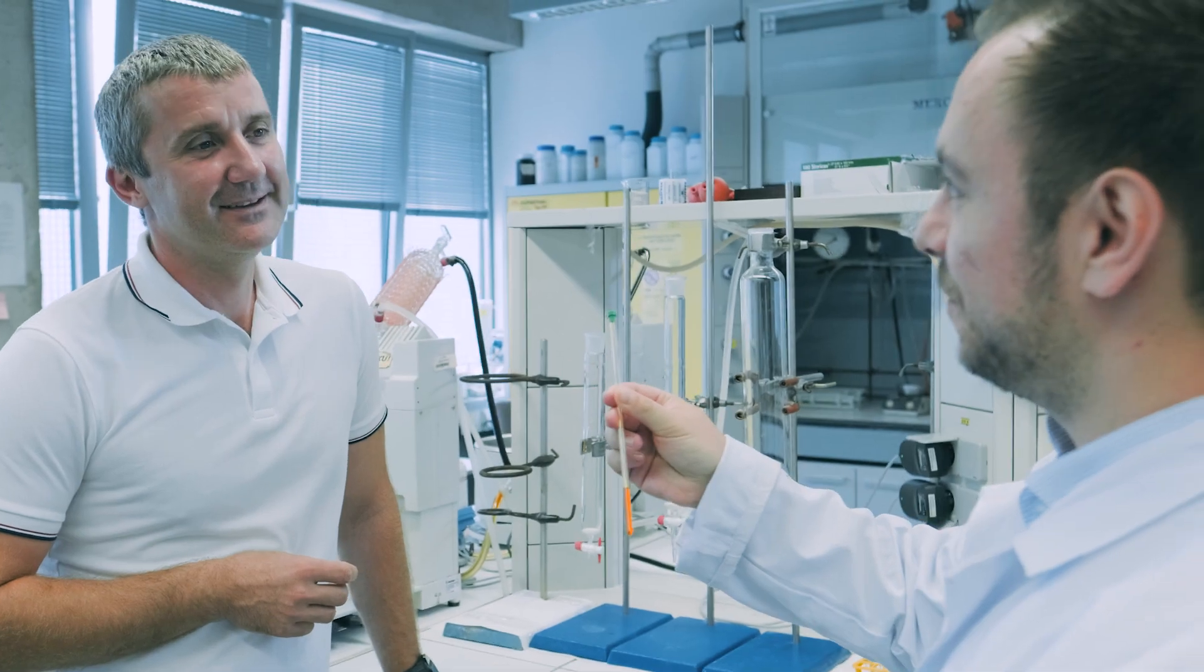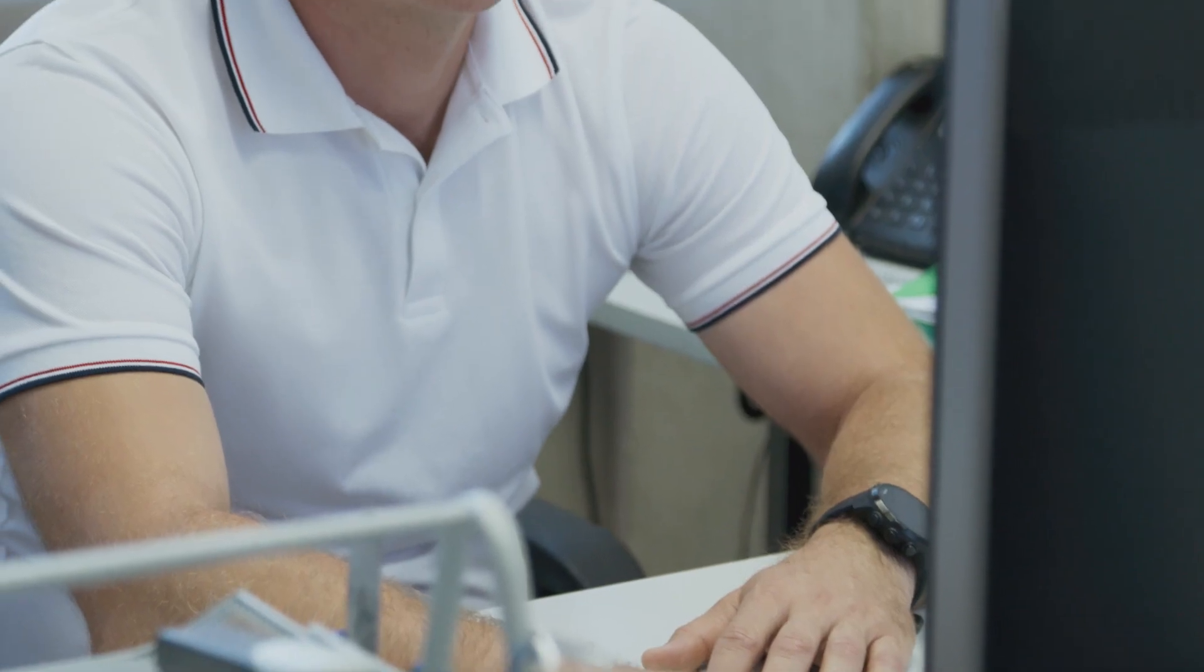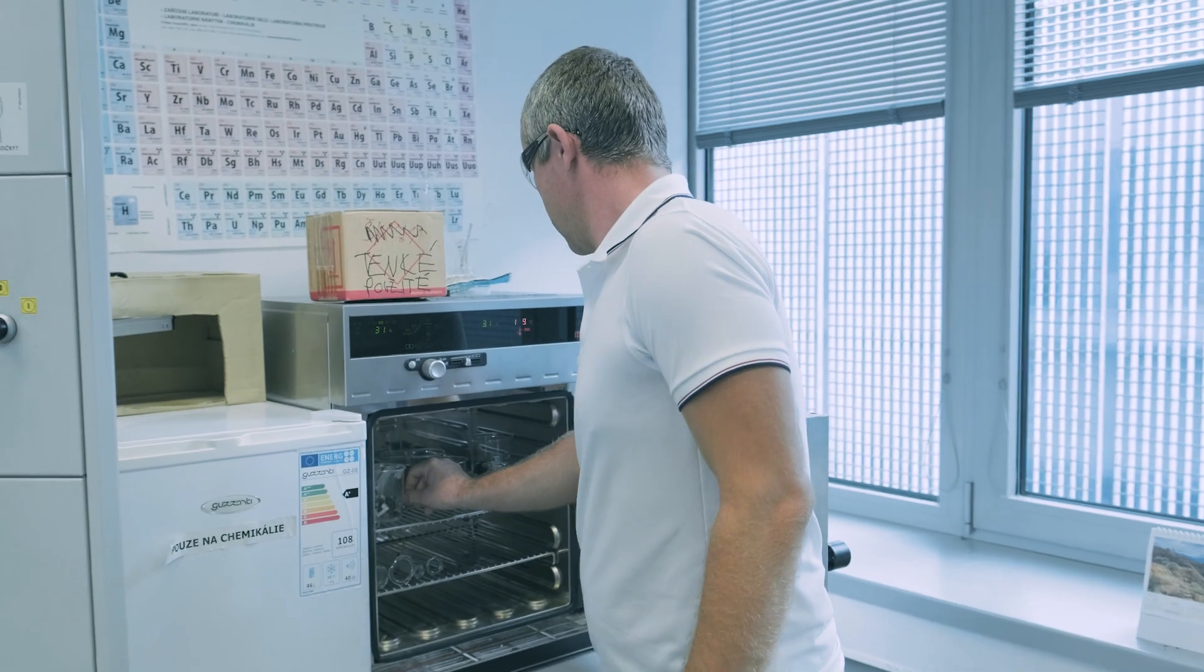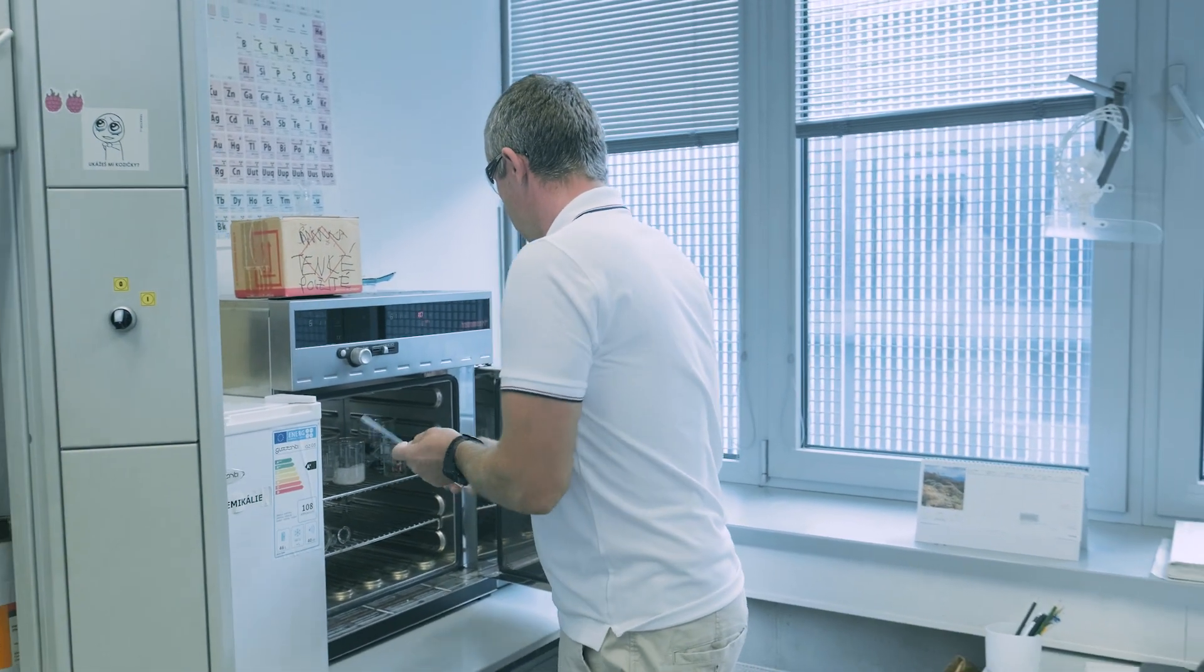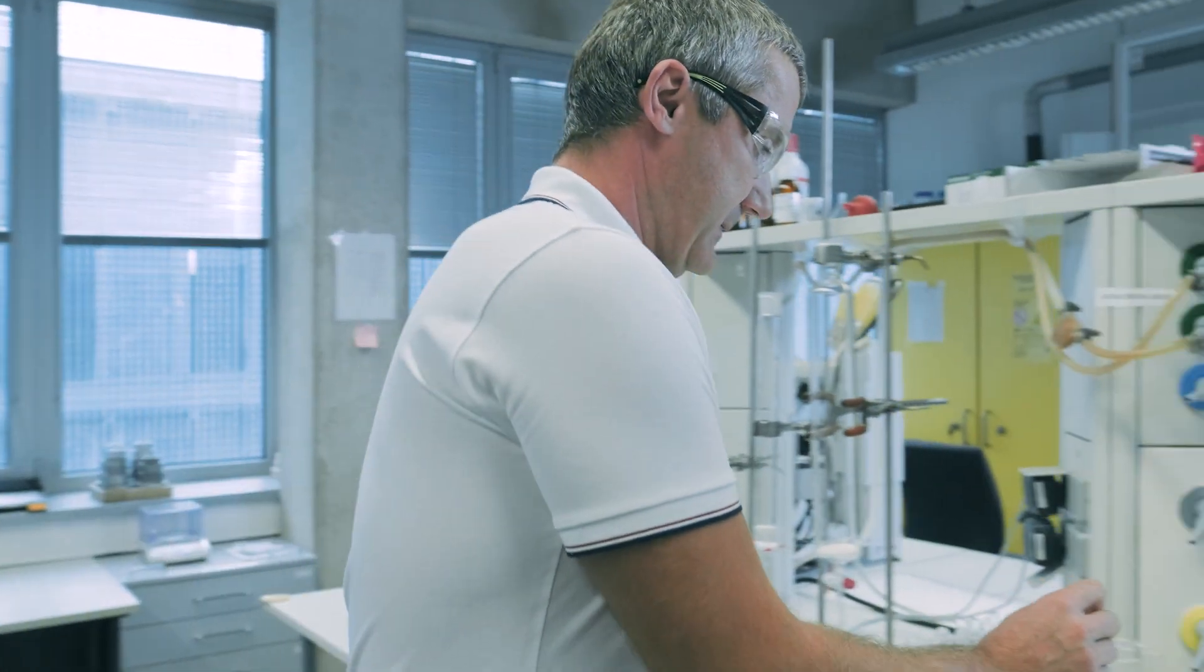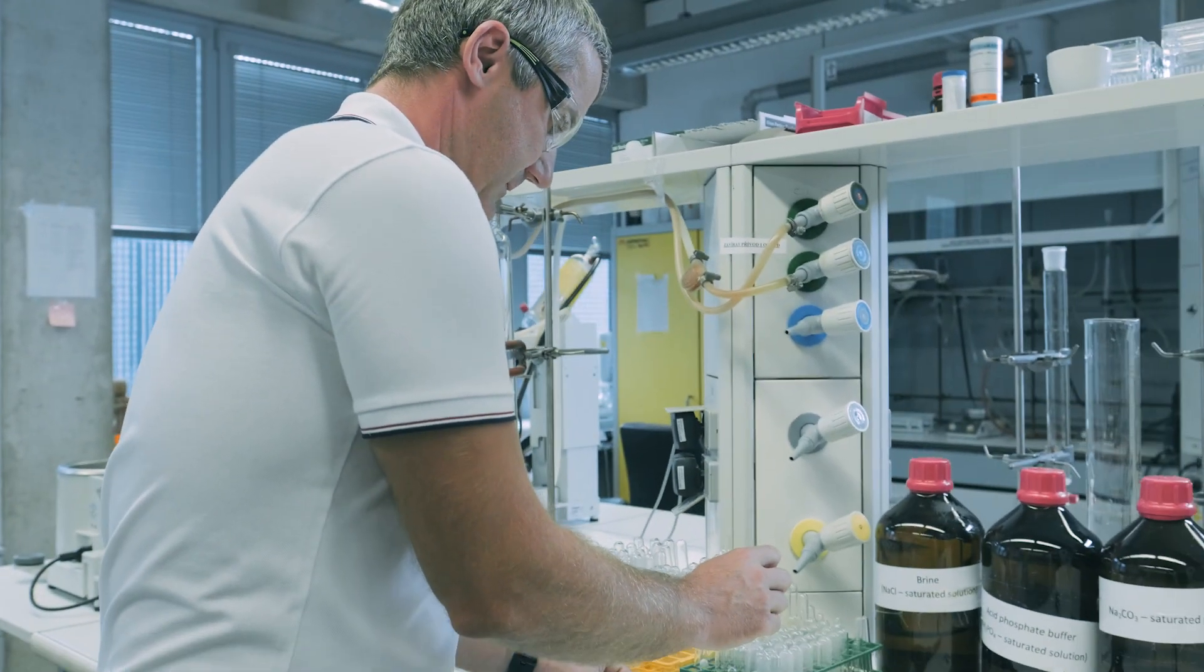Of course, we did a screening of benchtop NMR devices available in the market and analyzed the approach of Nanalysis company. We found it useful and especially NMR ready 60 fulfilled all the requirements which we requested.